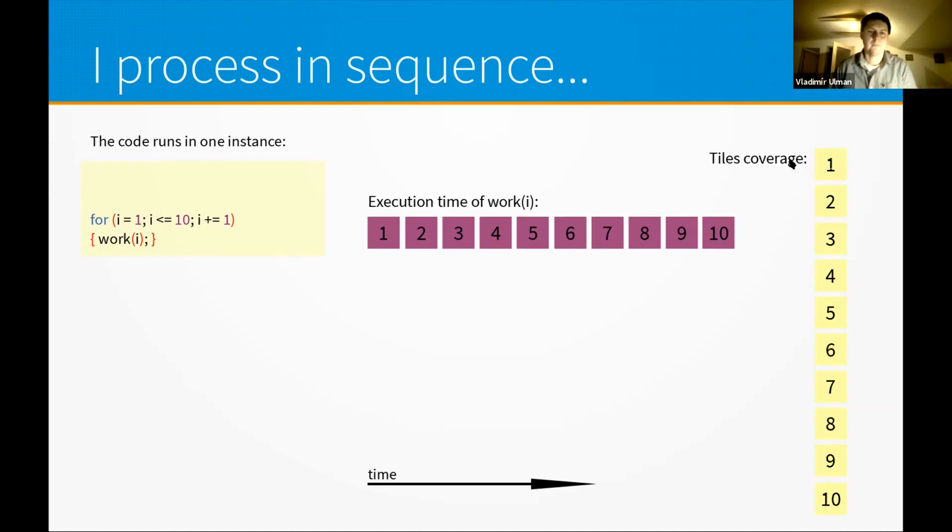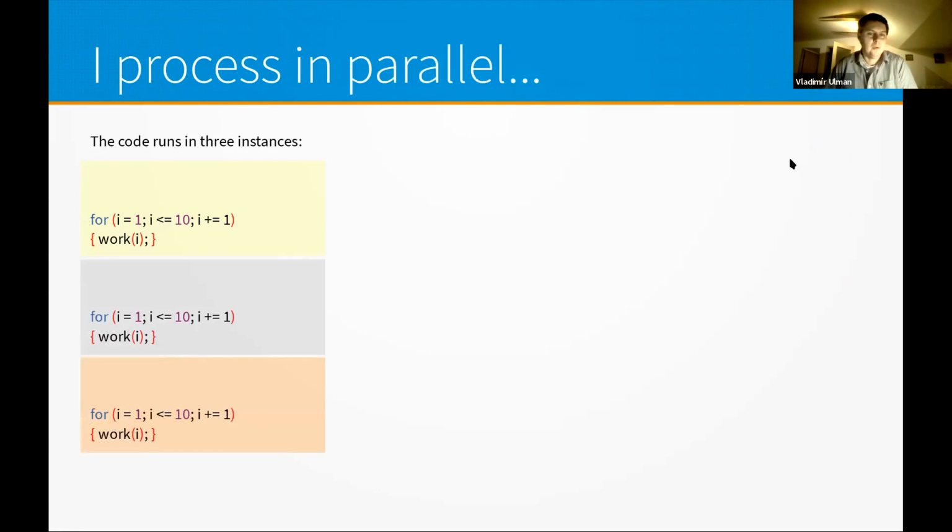Now we can upload this macro on the HPC system, and we already saw it. One macro is executed, and the very same code is executed at all the computers. So here, let's take the example of 3 computers. We have these 3 scripts running on the 3 computers at the same time.